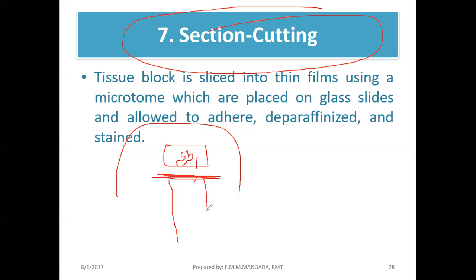These are actually thin films. Okay? The tissue ribbons are thin films that have impressions of the tissue. Thin impressions of the tissue. So meron siya niyan. Okay?